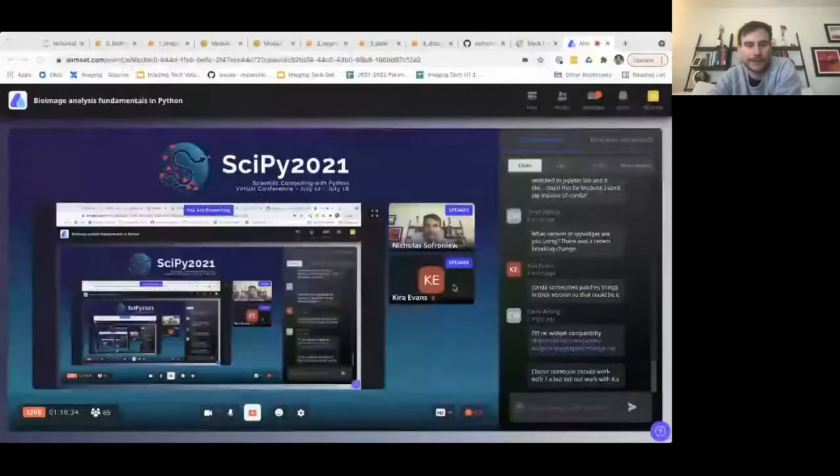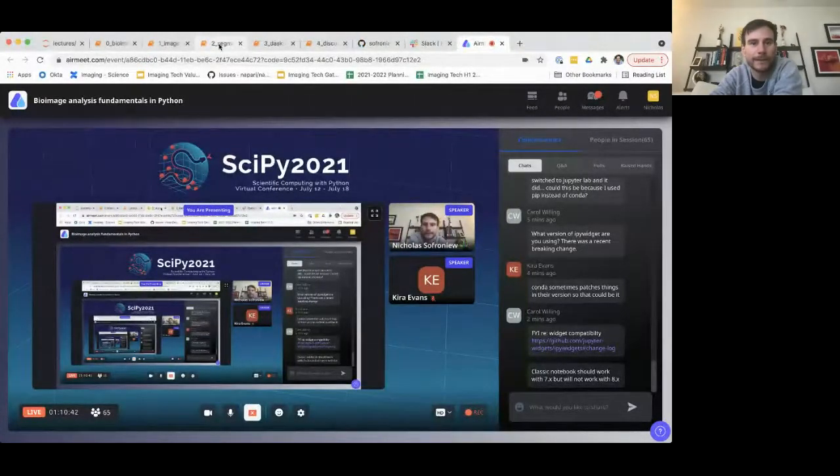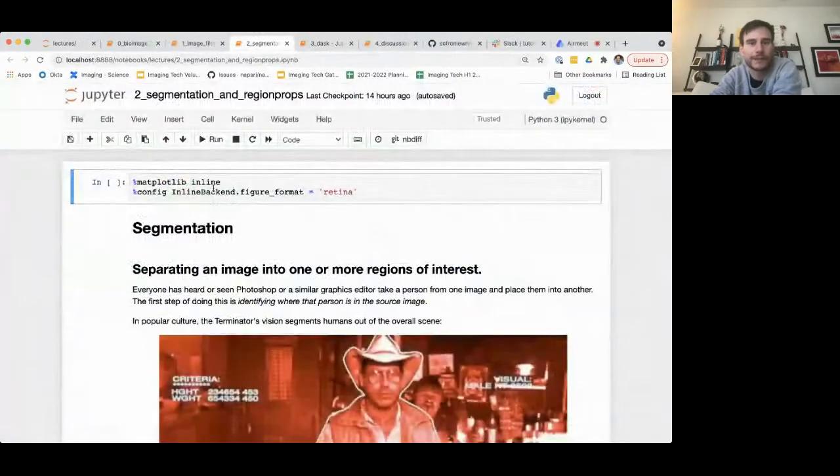So I'm going to share my screen again. Give it a second. So yeah, hopefully folks can see my screen. I see sort of infinite recursion, makes it look like it's going well. And yeah, let's close this tab and take us over here to the second lesson.